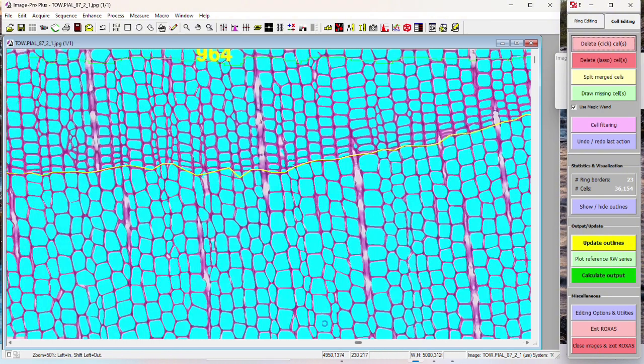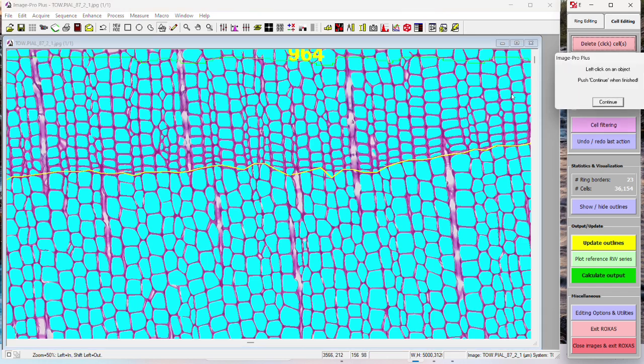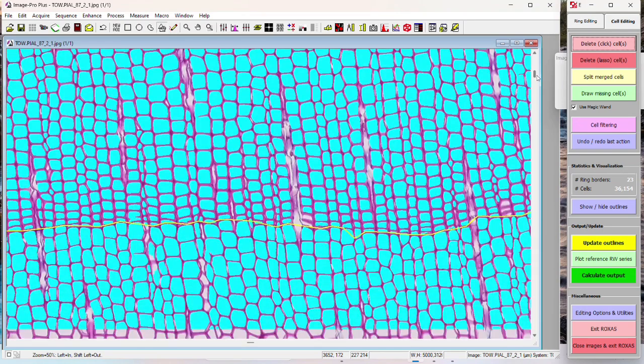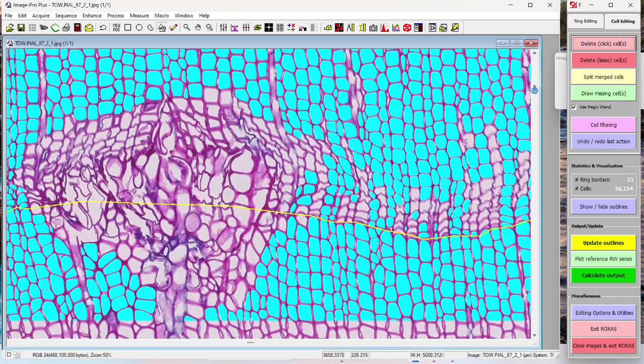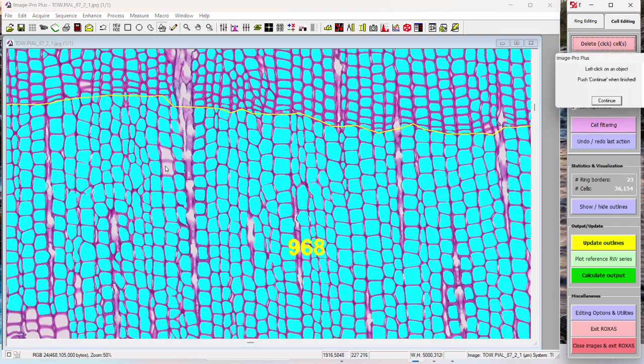I'll go ahead and move over probably like to the middle. And if you're only zoomed in like one click, then this should help you go over the entire image, so you see everything, all the rays, depending on how slowly you're moving. If you sense that there are a lot of incorrect cells, then you might go a lot slower, but if you sensed earlier when editing the image that there weren't a lot of incorrect selections, then you're not going to go super slowly. You can also grab anything that you might not have noticed before.